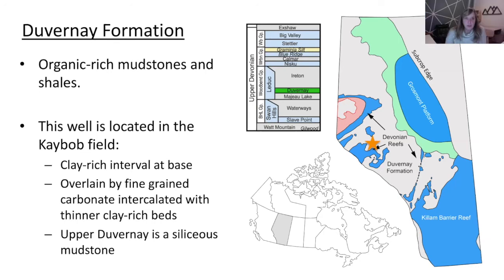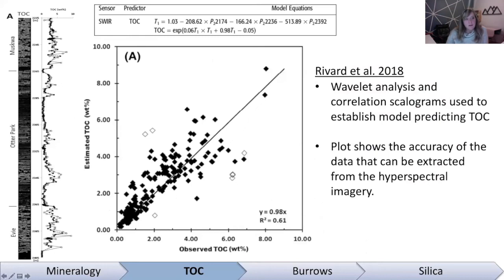Okay, so in terms of the data that I have been showing, which is mostly imagery, that would not be what you would get from the handheld detector. But in terms of what was shown in the image with the TOC, which I'll just go to now, something like this, this TOC weight percent is actually something you could collect with a handheld sensor. So you get the same spectra. In fact, the handheld sensors are more precise in terms of the spectra that they will provide. And so if we have messy spectra with noise and various things, we would actually take the handheld sensor and apply that in specific regions to clarify what we're seeing and make sure that we've accounted for any noise associated with imaging from a greater distance.